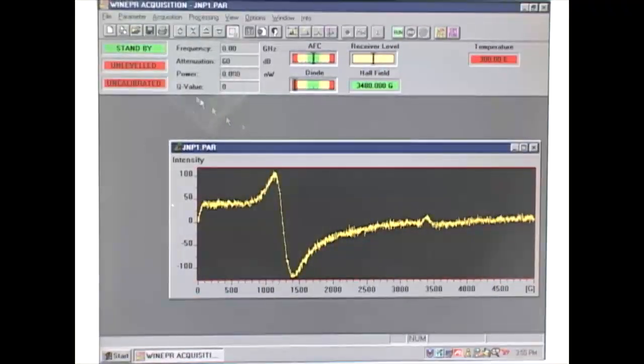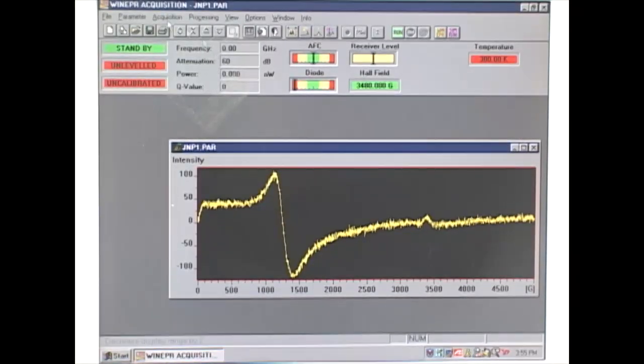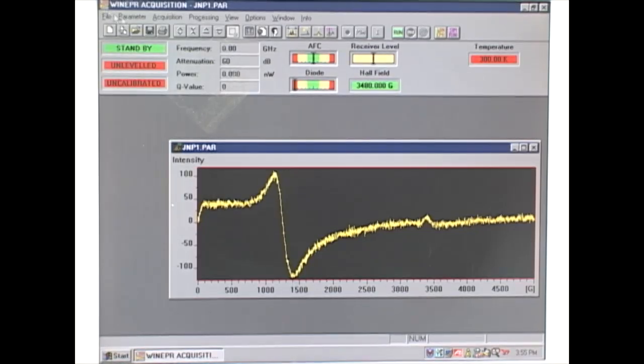What we have here is our nickel sample. We can conclude that the signal tells us this is a uniaxial anisotropy sample, meaning it has just one axis.